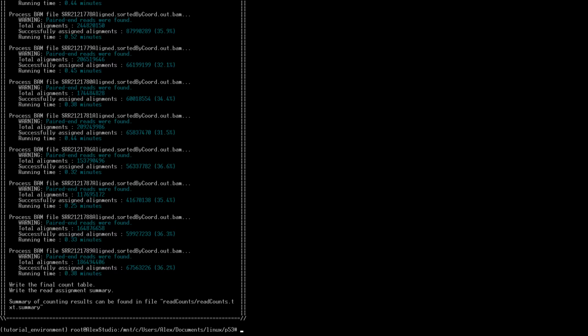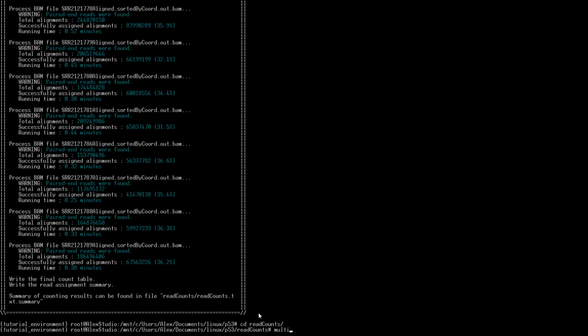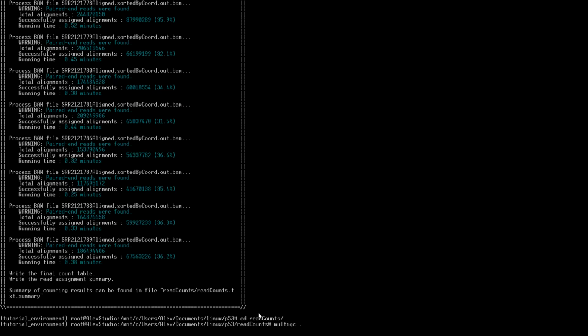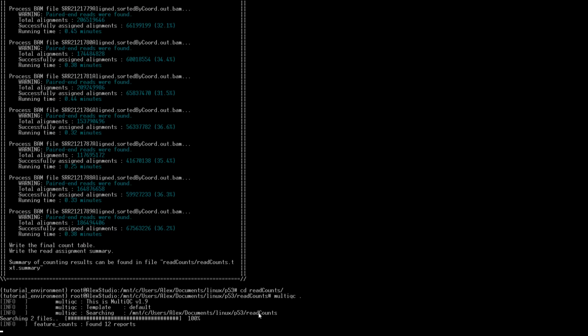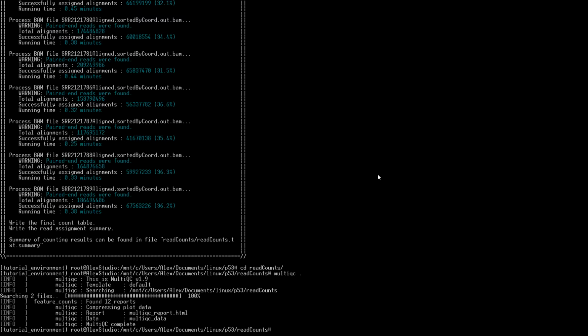Okay, so now featureCounts is finished. Go into our read counts folder. Run MultiQC and see what we get. So it found our 12 reports within our file.